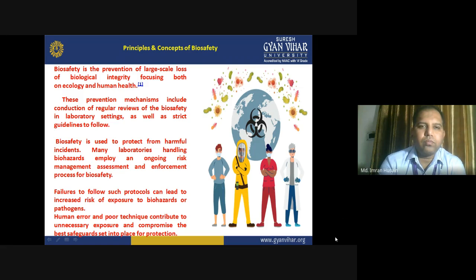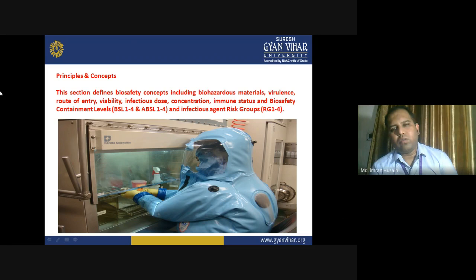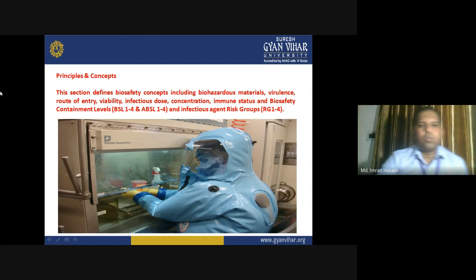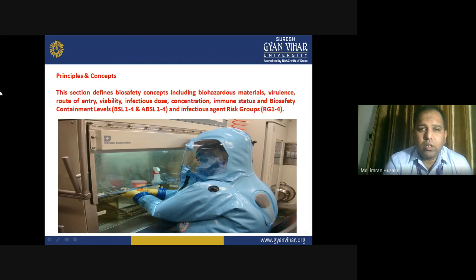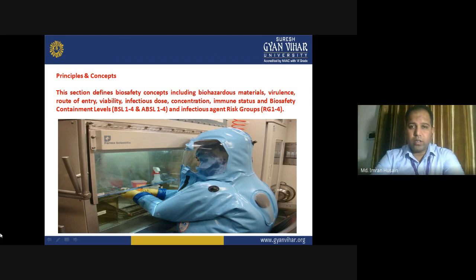Here you can see a scientist wearing a full body suit with a cable connected to provide a unique atmosphere. Inside the suit, you are always wearing the PPE kit. We are constantly working on biosafety cabinets. This section defines the biosafety concept including biohazardous material, virulence, routes of entry, viability, infectious dose, concentration, immune status, and biosafety containment levels.